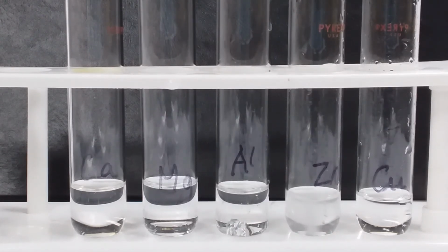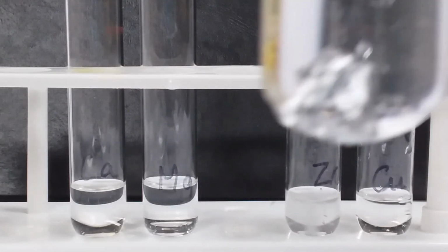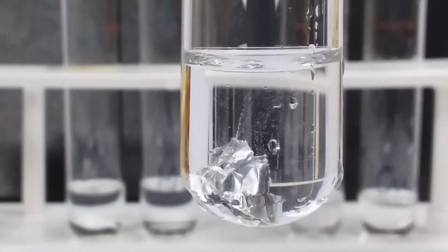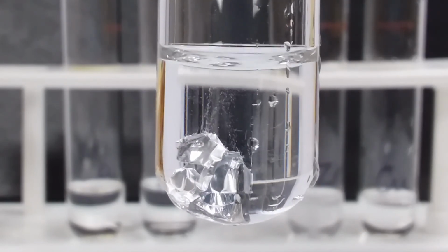So you'd see that the aluminum has sunk. And if we look very, very closely, the aluminum is now starting to react.